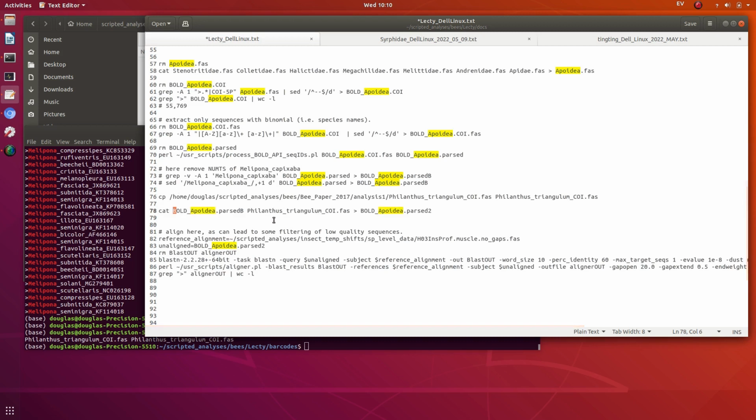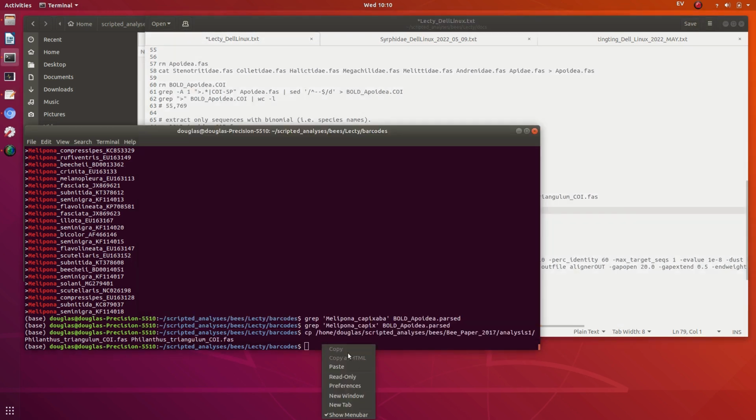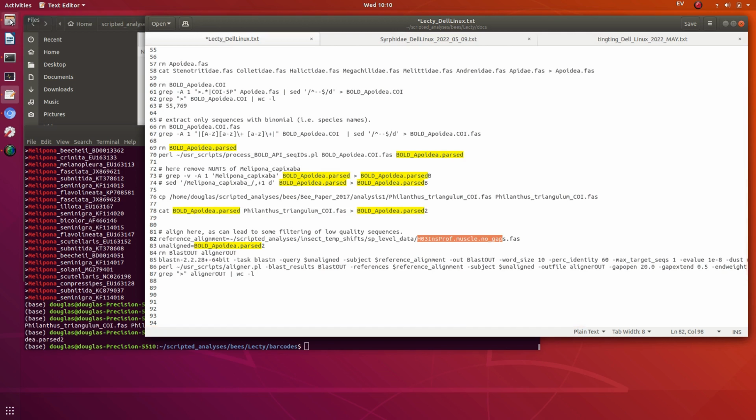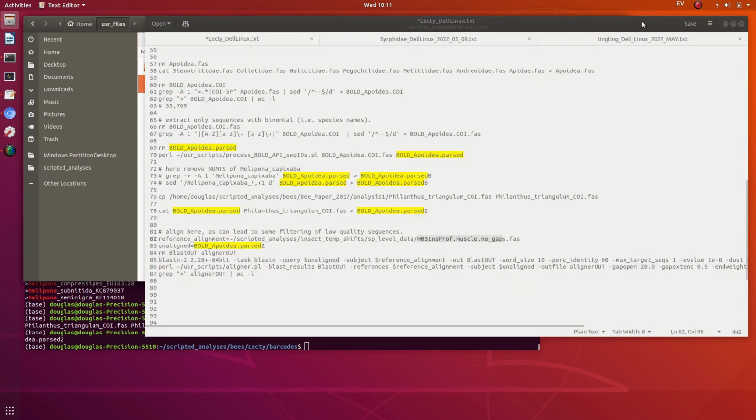I'll have to change this name here. Okay, so this will be in a different location now. Let me just check. Okay, I'll change this location to something else.